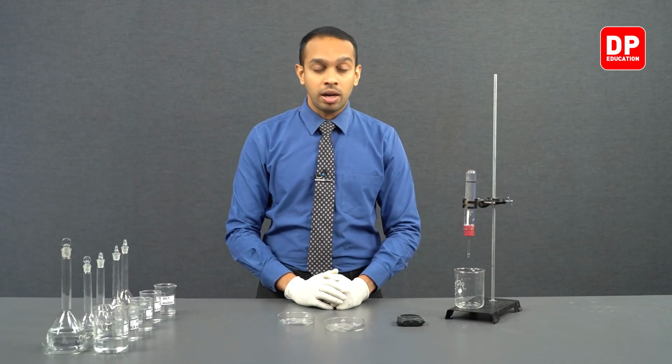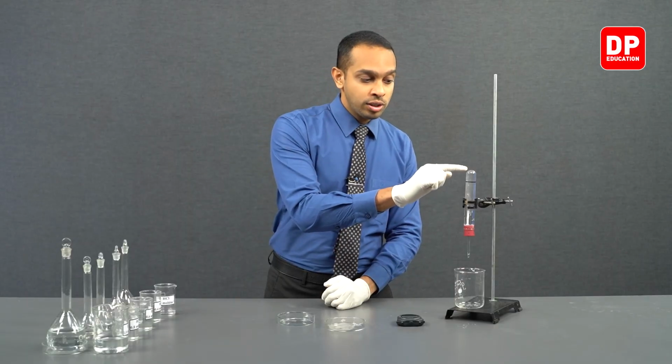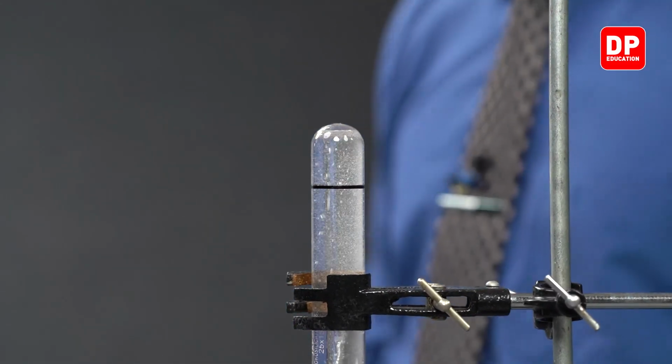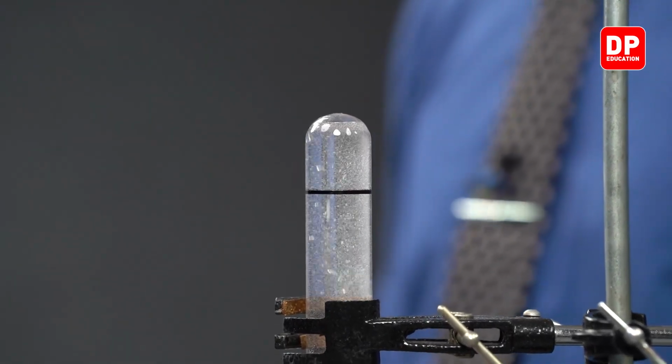So we have turned on our stopwatch. We have to wait till hydrogen gas gets filled all the way to this mark that we have made on this boiling tube. And after that, we can move on to our next experiment.